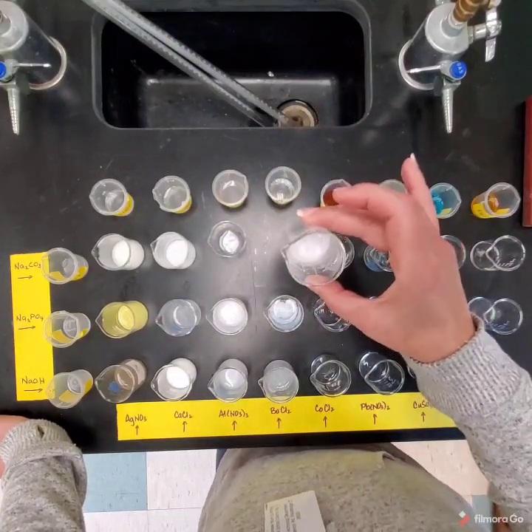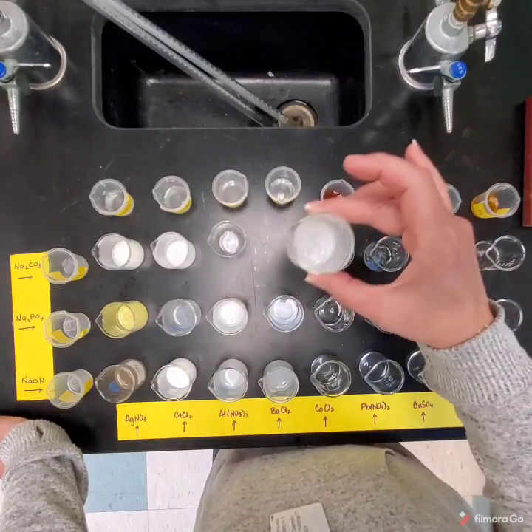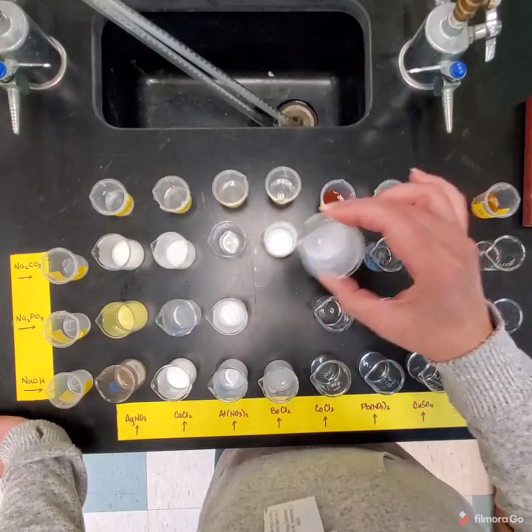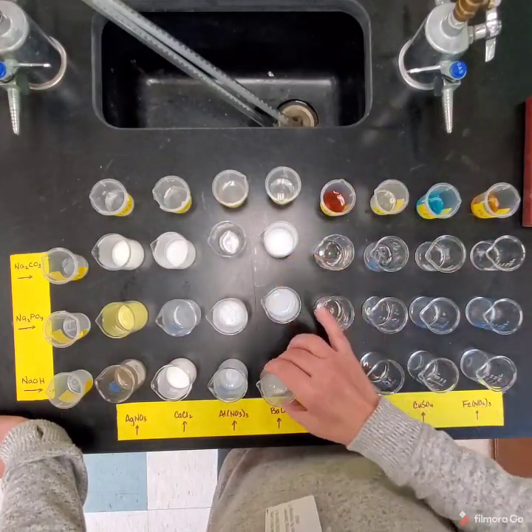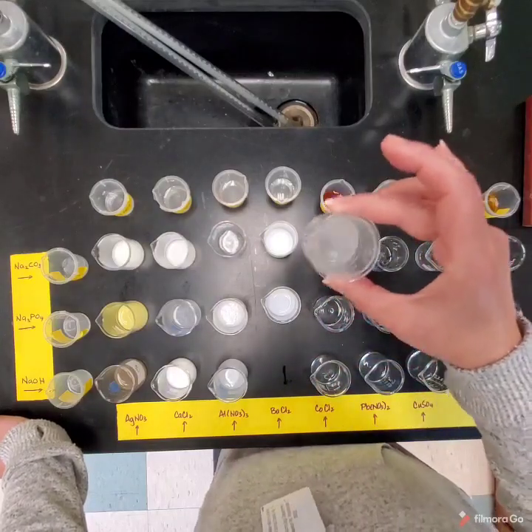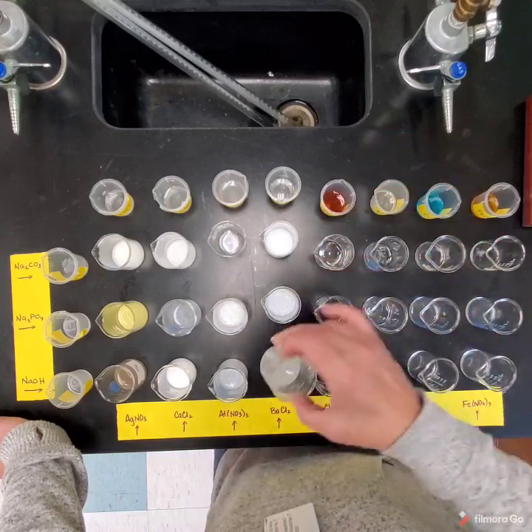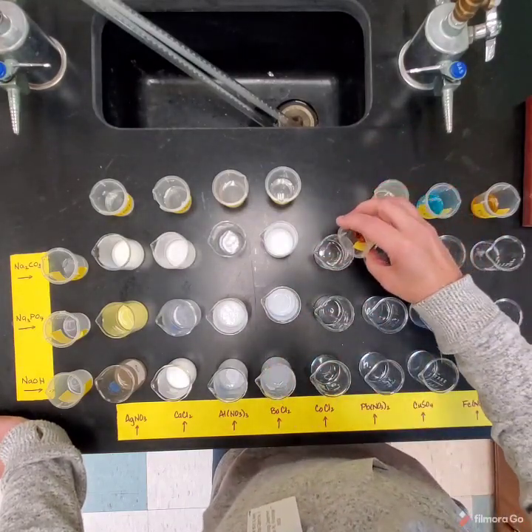All right. There's a lot of similarities. This one is much more watery. It's not as gel-like. This one's a little thicker, a little more gel-like. This one's very watery, very fine powder. Okay, cobalt chloride.